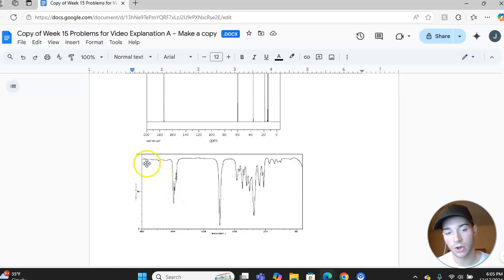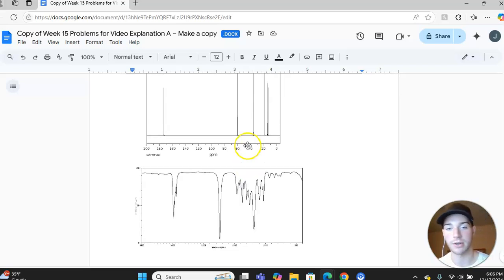And then also, if it was an amide, it would have an NH2 group, and the NH2 group would have 2 peaks somewhere above 3000 wave numbers as well, and because it did not have that, I could get rid of an amide. So the immediate favorite for the functional group that was within this molecule is an ester. So that's what I first drew on my paper, was an ester, just to get something down.